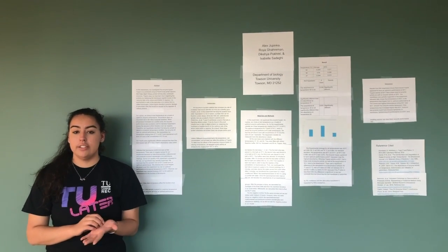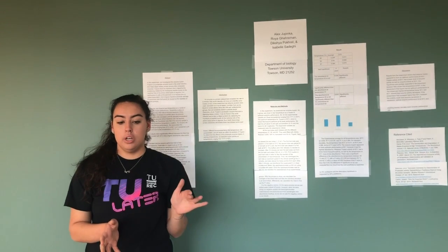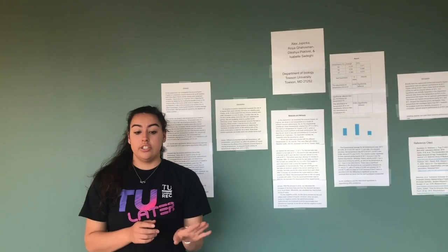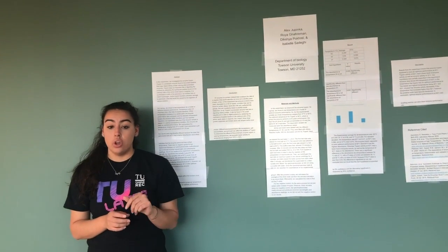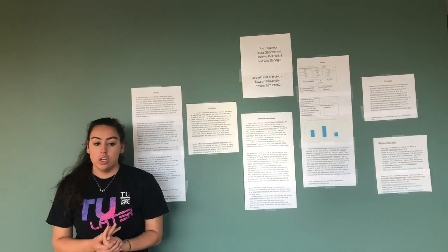The conditions of our experimental variable were temperatures of 37, 50, and 60, and the conditions of our pH were level 9, and our conditions of salt were a concentration of 0.15 moles.